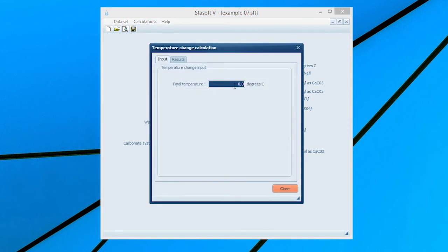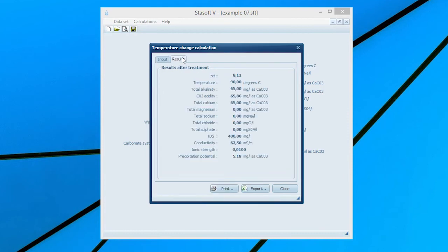Enter the final state temperature by typing 90 into the final temperature input box. Selection of the Results menu option will bring the Results After Treatment window onto the screen with values of the new state of the water.